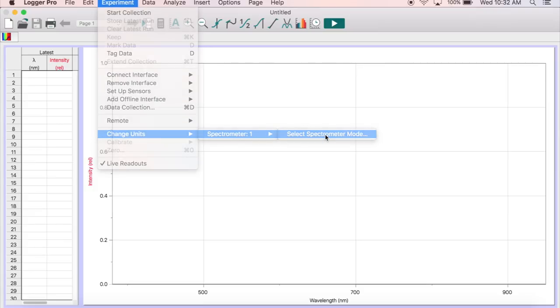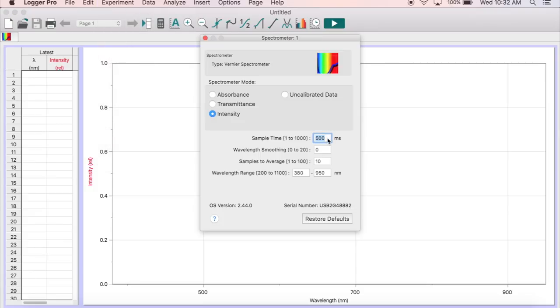You can also set the Sample Time to 1000 milliseconds if 500 is not sufficient to detect the light intensity from your solution.